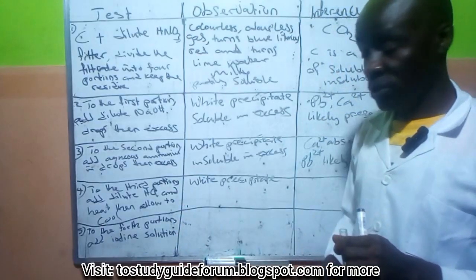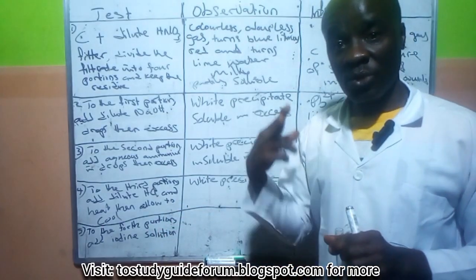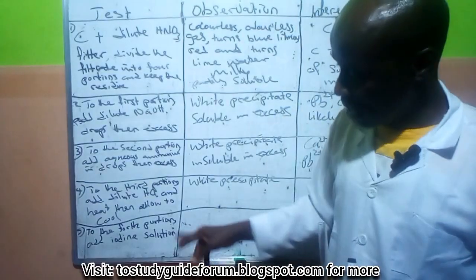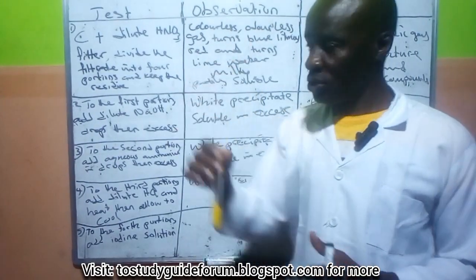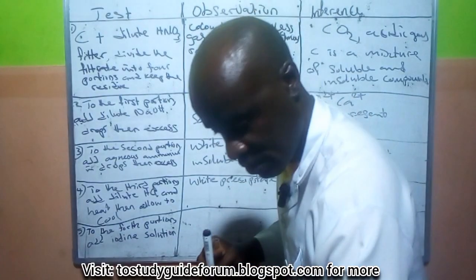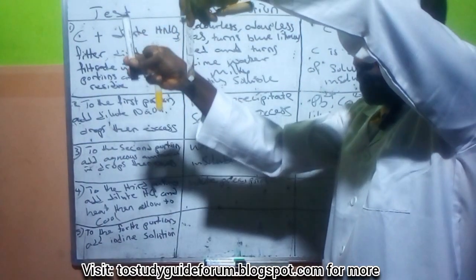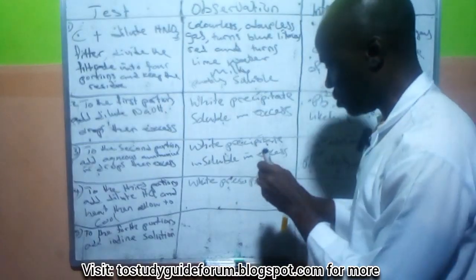Besides the identification with dilute hydrochloric acid, we can also do that with what? Potassium iodide. Potassium iodide can be done. The potassium iodide in this exam is hidden in the word iodine. So I don't want you to rule out the idea of using iodine to test for this, because all I'm showing you here is all the test for this very compound. I think we have this thing now. Yeah, this thing is back. It's cold now. You can see the precipitate coming out again. The precipitate is back. So let's complete this side and go ahead with what we have.